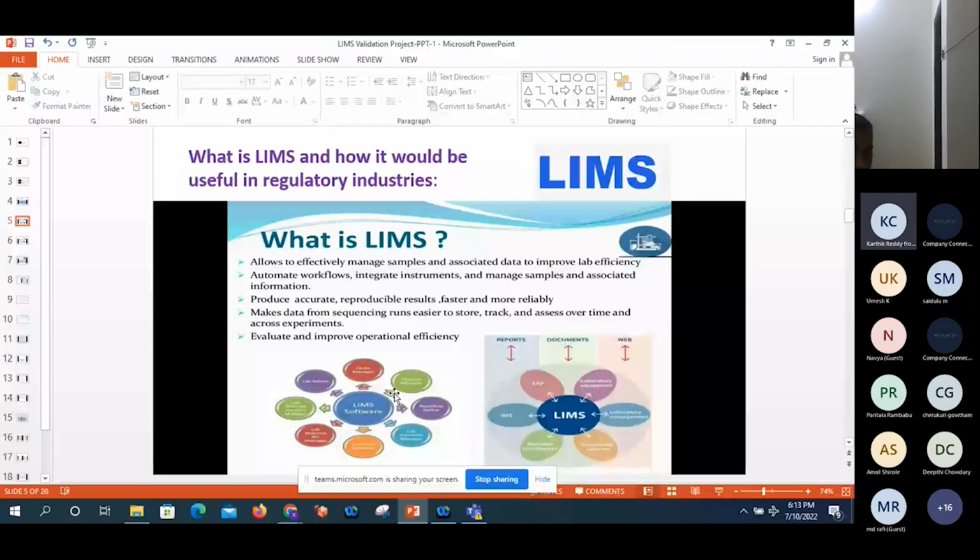Once reports and everything are generated, anybody can believe them, like regulatory auditors. People are managing without paper-based methods, mostly as per ALCOA, like attributable, legible, and so on, which is ALCOA Plus. So the data is generated with metadata.